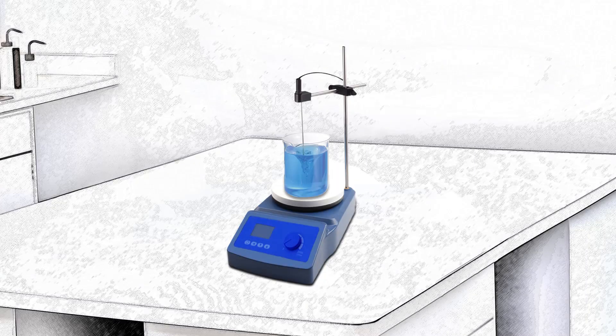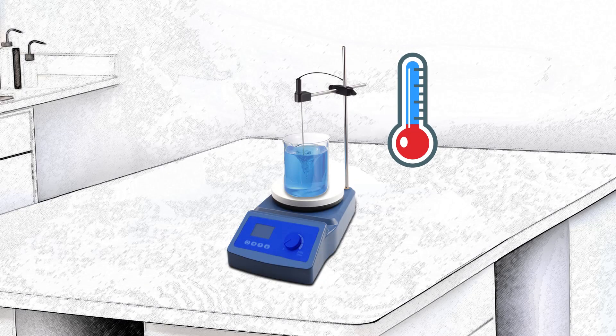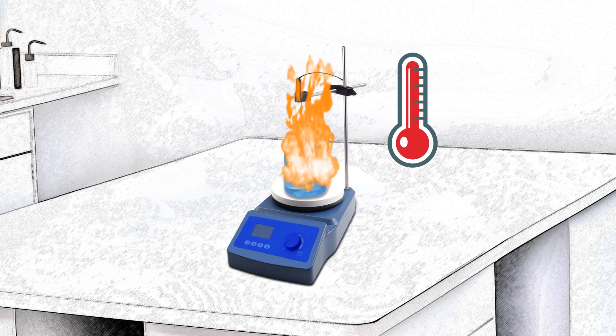Accidents involving malfunctioning hotplates and hotplate stirrers have caused catastrophic laboratory fires that could have been avoided. The ability to monitor and detect potential hazards before they occur is an essential feature of any hotplate stirrer with superior safety features.